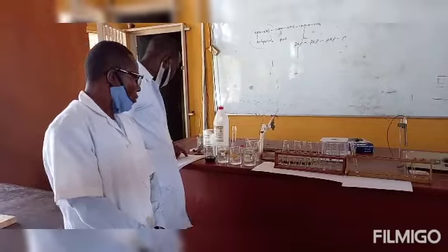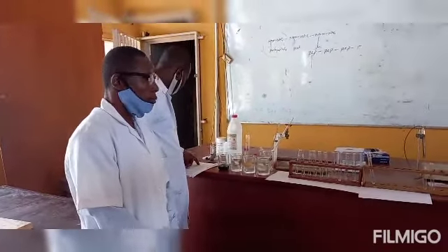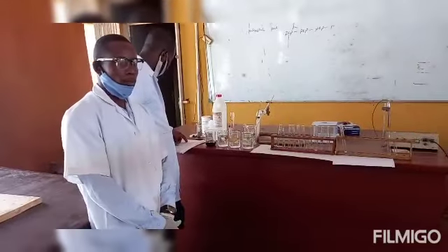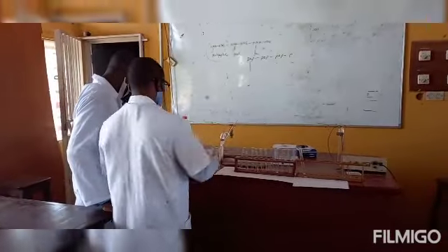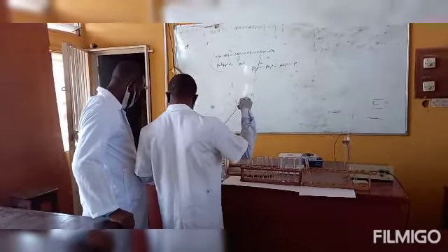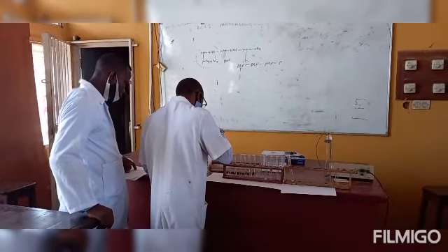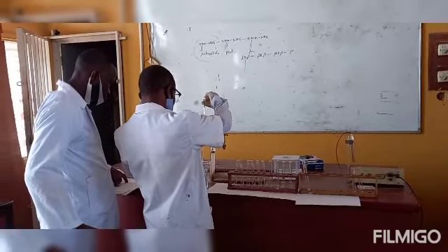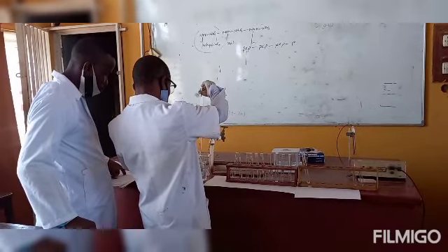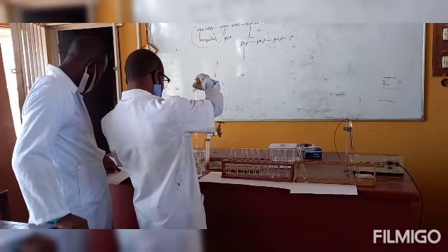Test tube 3, 1.26 ml. Then 1.77 ml, 2.36 ml, 2.95 ml, 3.49 ml, 3.93 ml, 4.27 ml. To test tube 10, you add 4.52 ml, while to test tube 11, you add 4.69 ml, in that order, chronologically.